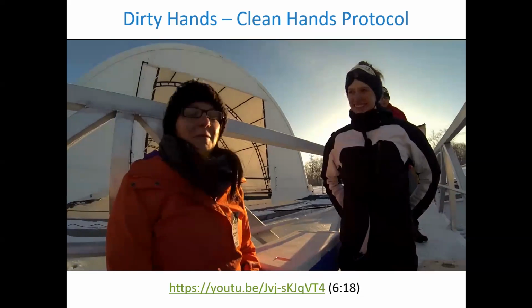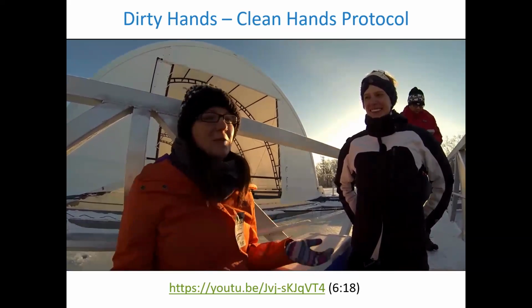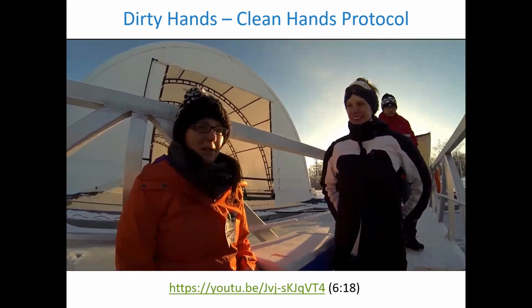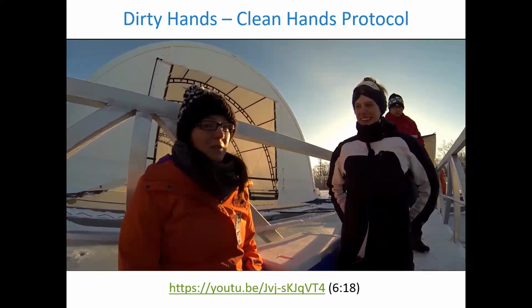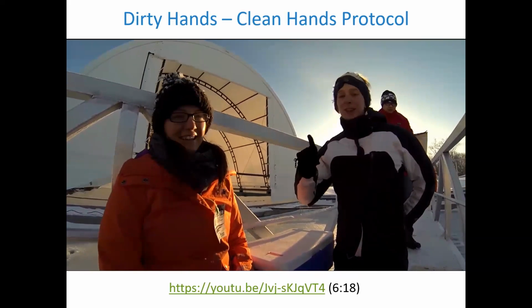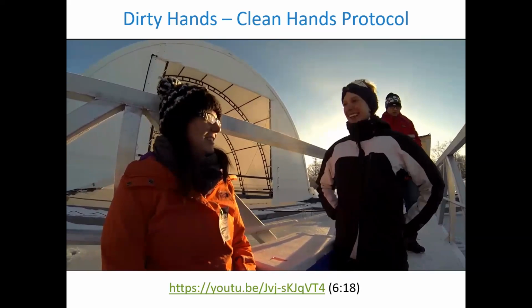Well, Sarah, when we're sampling for mercury and other trace contaminants, the biggest source of contamination is humans. And we want to make sure that we're not adding any contamination to our sample and we're getting an accurate measure of what's in the environment. Specifically for mercury, we're actually looking at the parts per trillion level, so we have to be very clean when sampling. So remember, don't be afraid of your sample. Your sample's afraid of you. That's right. All right, Sarah, shall we start?